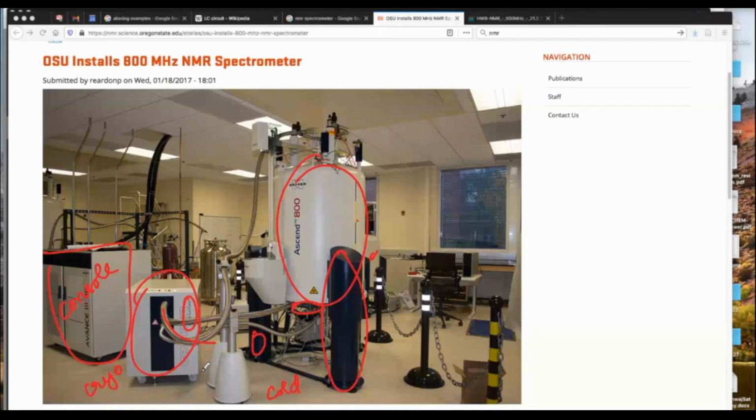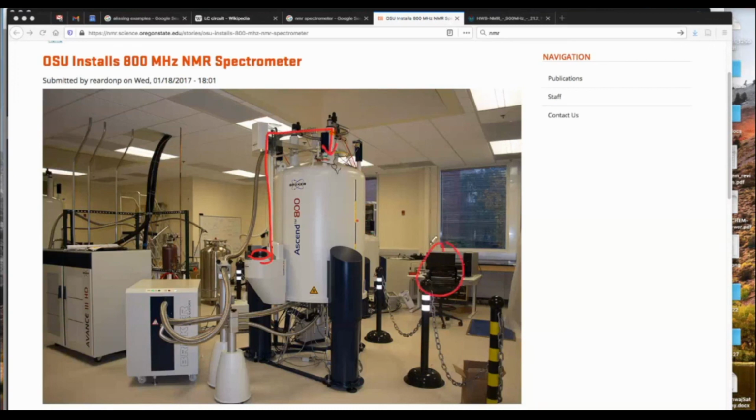Yet another thing that you are able to see here is called an auto sampler. What it does is that you can put 24 samples at a time, and the spectrometer can automatically, with a command from the computer that you type here, switch samples from here. So that's the only addition that you end up seeing.